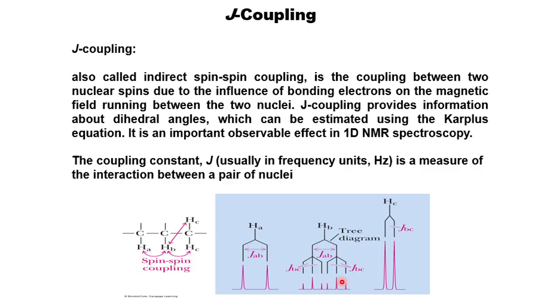That's why NMR can precisely determine the structure or geometry of the molecule. And you see the HC, these two are equivalent protons. That's why it is higher intensity, but since it is interacting with HB, you get a doublet type of peak. Ideally it must be a single peak, but since there is coupling with HB, you get two peaks.